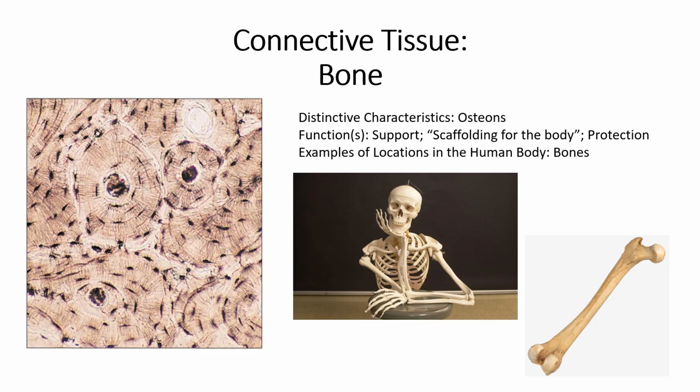In the center of the osteons is where you have your central canal, so that's this dark spot. All of the little dark, kind of squished concentric circles that you see making up the rings of the osteons are your lacunae with cells inside. So this is why I said you still see lacunae when we talk about bone, but the lacunae are not as well defined, or not the exact same structure as what we see with cartilage. All right.